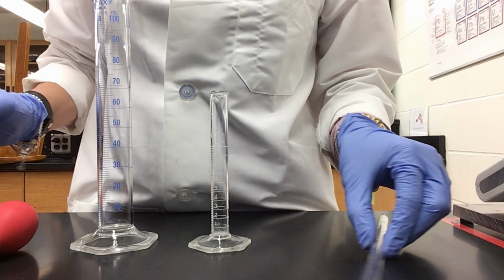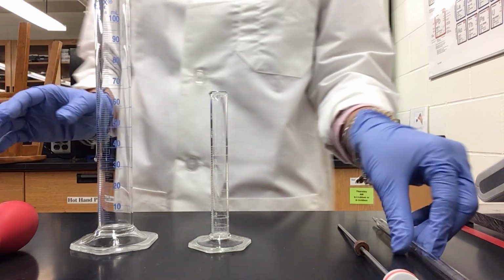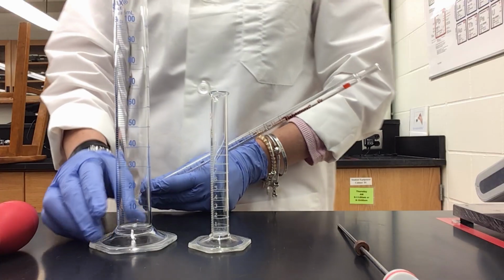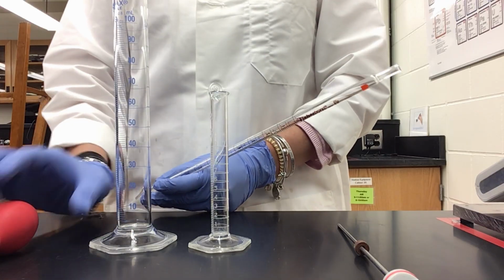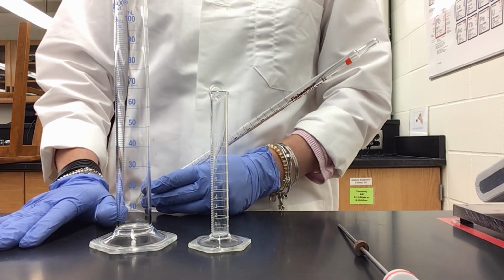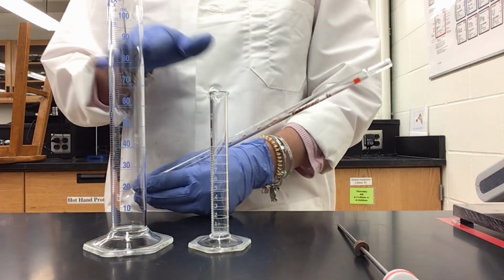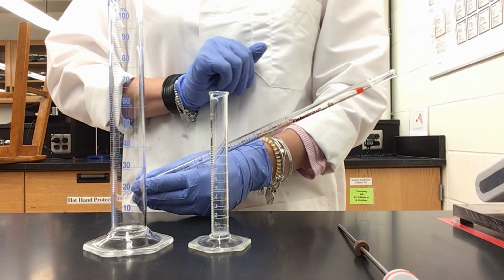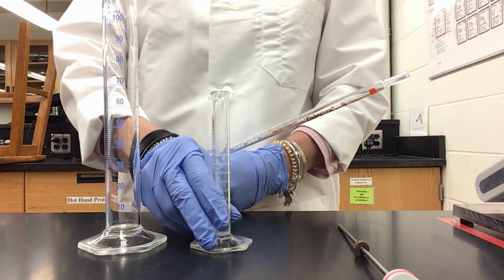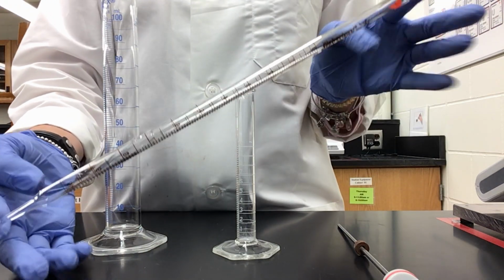So in part 1, we have the goal of determining which one among these 3 pieces of glassware is the most accurate and precise to measure volumes of water. Okay, so what we're gonna do is we're going to measure 10 milliliters of water with each one of these 3 times. So 3 times with the 100 milliliter cylinder, 3 times with the 10 ml cylinder, and 3 times with the 10 ml graduated pipette.